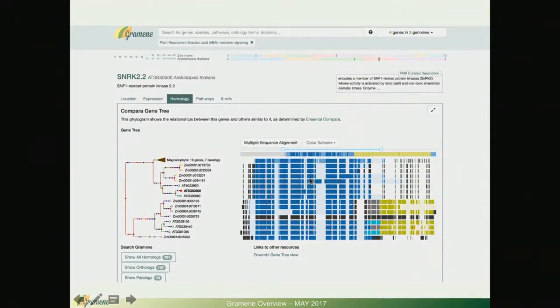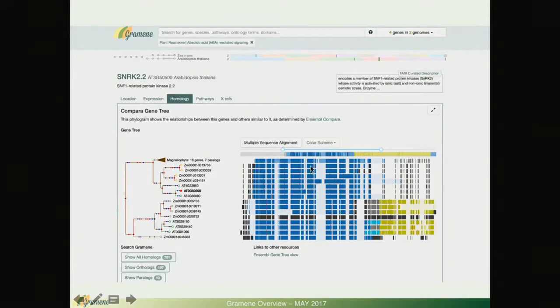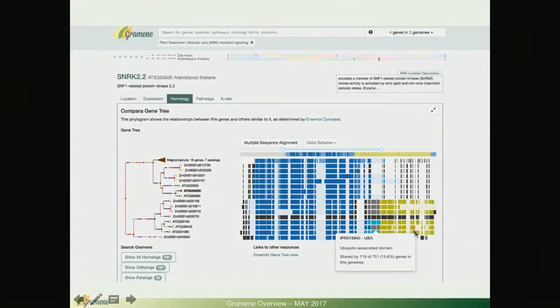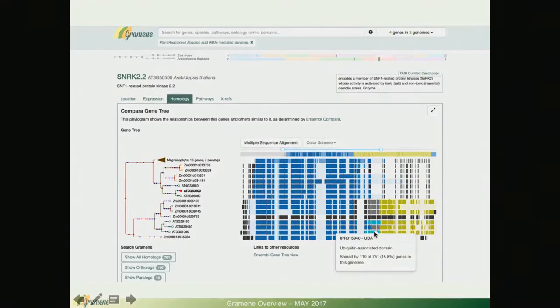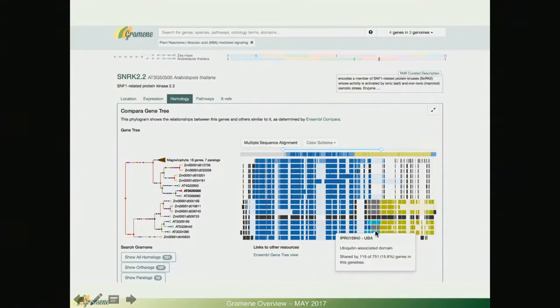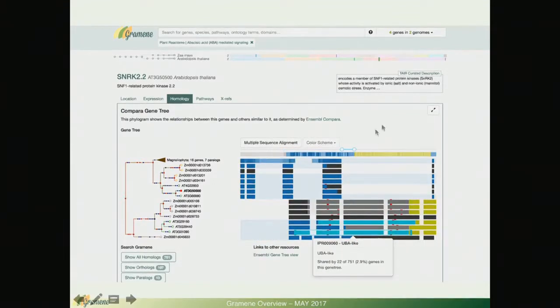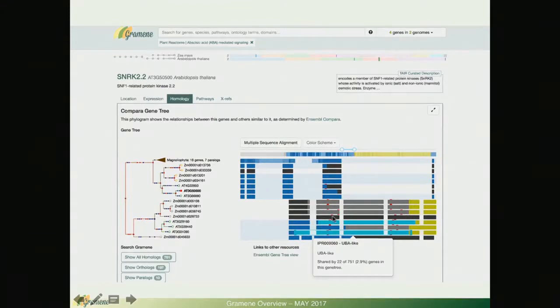You can more easily see features such as exon junctions and these are small red ticks in between. You can also hover over and click over one of these colored InterPro domains and more information will be displayed about a particular domain.